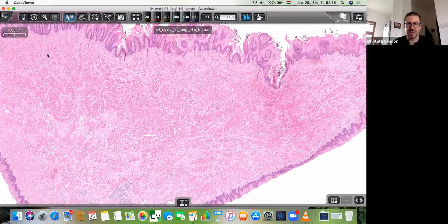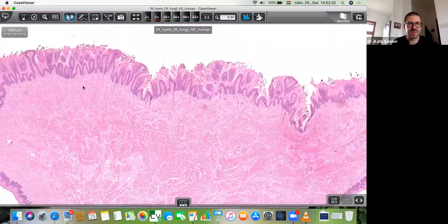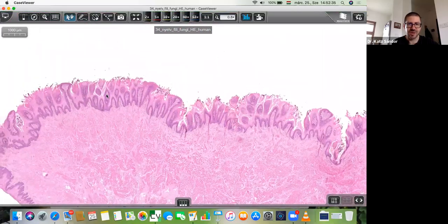So superior longitudinal right underneath the epithelium, inferior longitudinal here, and among them we can find the transverse and vertical muscles. So let's see the structures.